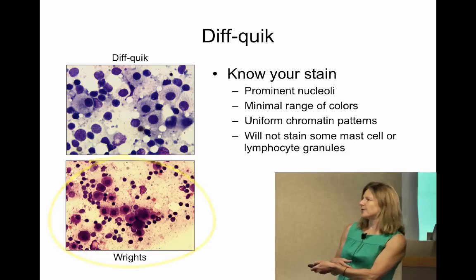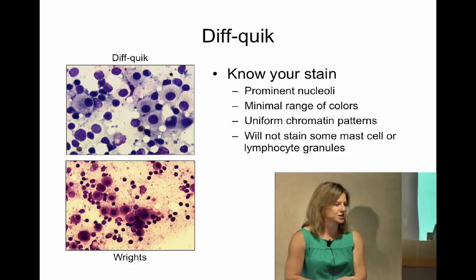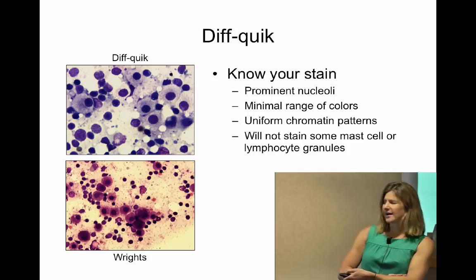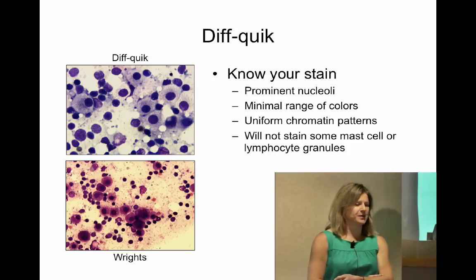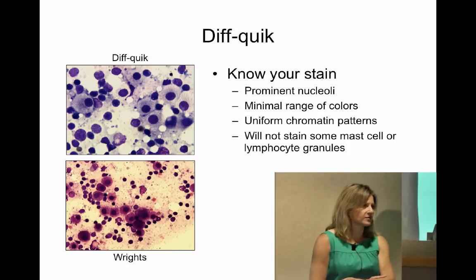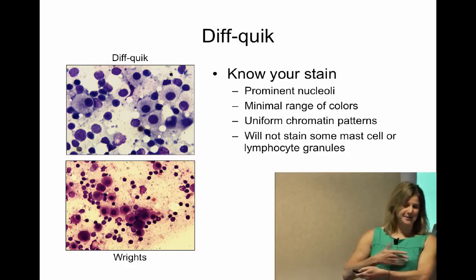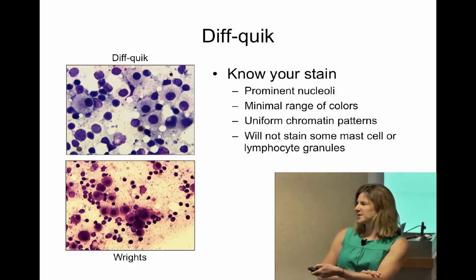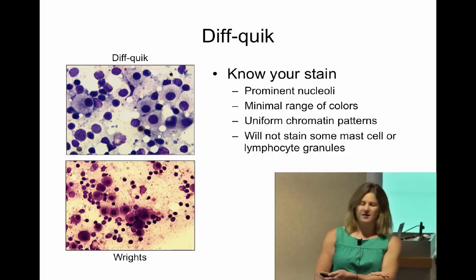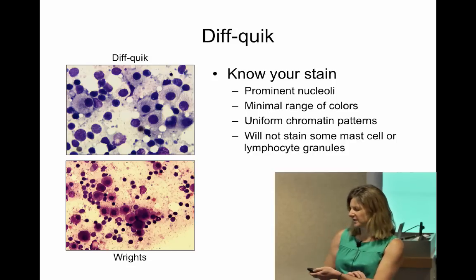And those lymphoma of granular lymphocytes, those granules really stain up very poorly with Diff-quik, which I discovered to my horror once. Which is why whenever I get an intestinal aspirate from a cat, I'm like, you've got to give me unstained slides, because I could miss this diagnosis, even if I'm looking for it. So that kind of freaks me out, not having my own stain to double check. So what we always do is we look at your slides first, and then we stain up ours if we need it. It's a good security check for us, because we definitely like our own stain.